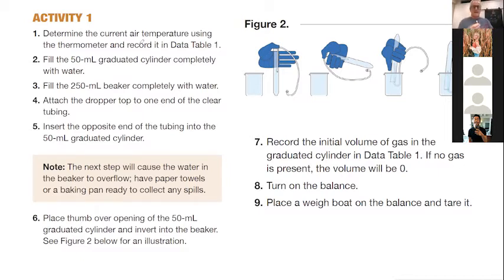So with the kit, you can see that we have this tube, about yay long, as it turns out. What you want to do is take this and push it into one end of the tube. Make sure that's on good and tight, because the last thing we want is for this to pop off in the middle of the experiment and have dangerous oxygen gas all over the place. We wouldn't want that. So make sure this is on good and tight.